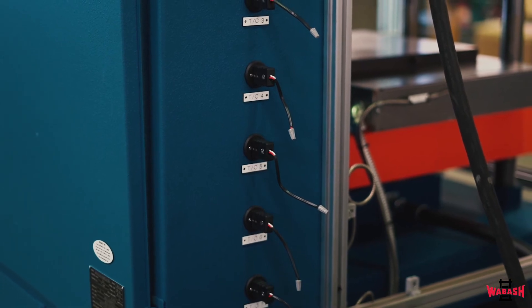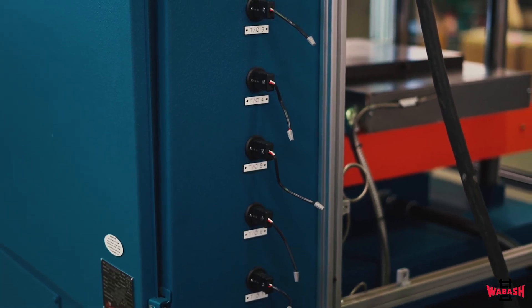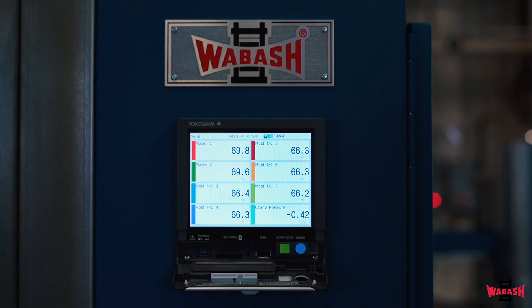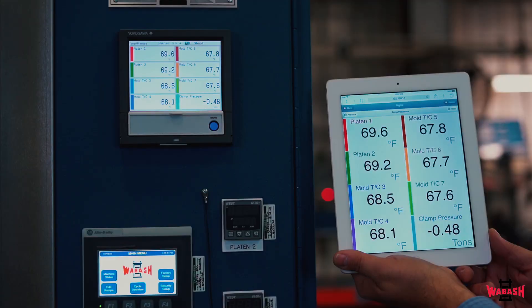In addition, mold thermocouples on the back of the electrical cabinet can be used to monitor and record actual part temperature during the curing of the material. The data can be extracted via SD card, USB drive, or ethernet port on the back of the recorder, or wirelessly monitored on your Bluetooth-enabled device.